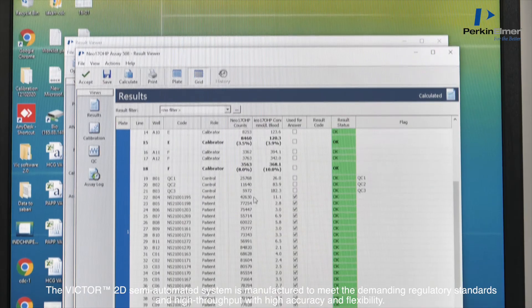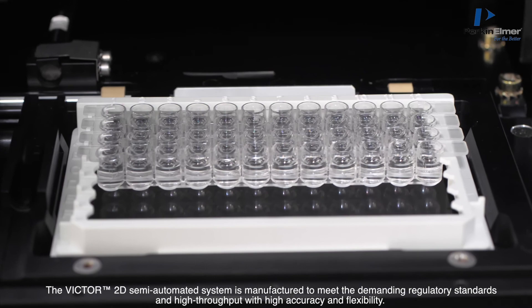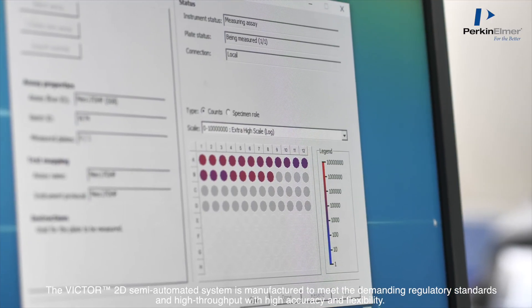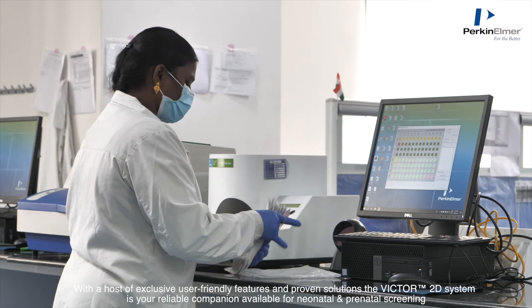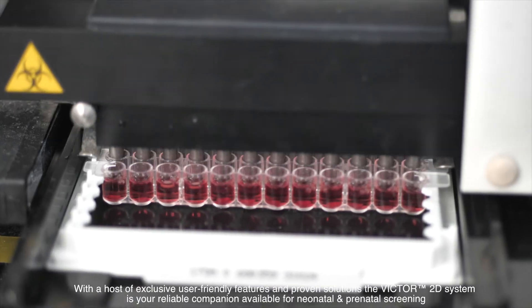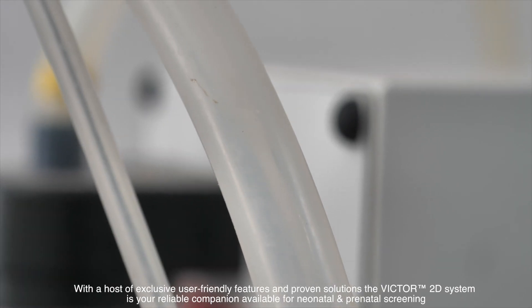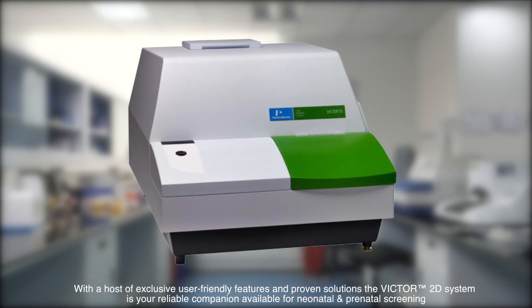The Victor 2D semi-automated system is manufactured to meet demanding regulatory standards with high throughput, high accuracy, and flexibility. With a host of exclusive user-friendly features and proven solutions, the Victor 2D system is your reliable companion available for neonatal and prenatal screening.